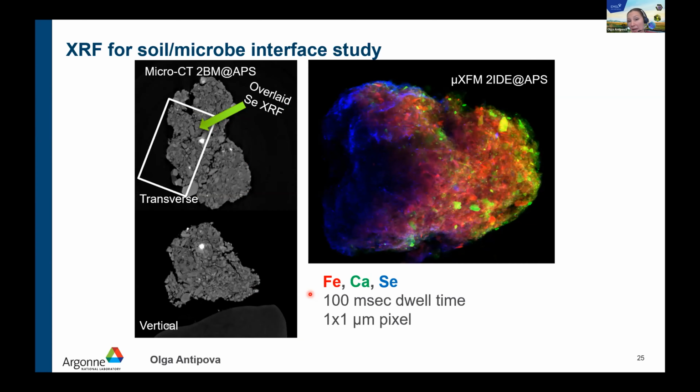As a result, there is this reconstruction of the slice, and what you can see here is not real-time bacteria colonizing that aggregate. It's just the gradual increase of intensity from selenium, showing how those bacteria travel through that slice.